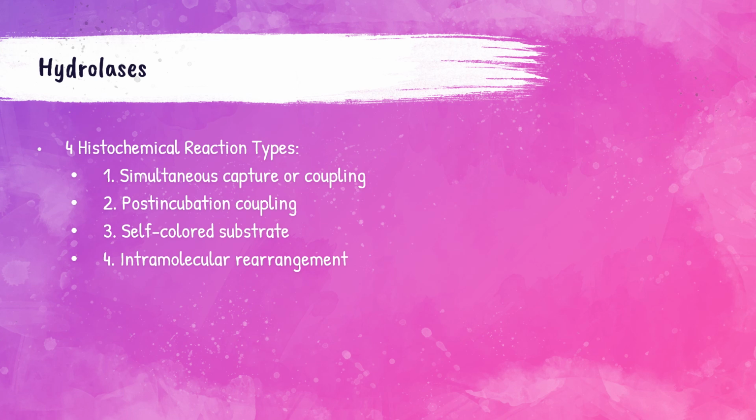The second reaction type is post-incubation coupling. This reaction depends on the formation of an insoluble reaction product, which must remain at the reaction site for the entire incubation period. The sections are then treated with a coupler in a different, separate step.